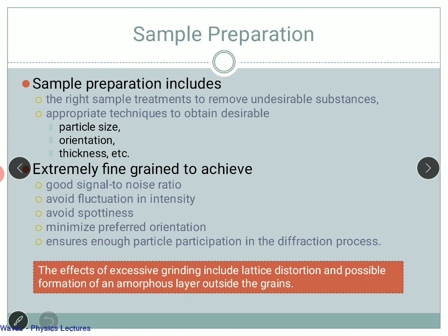XRD in the department, so we are going to use a powder XRD there. This slide is also very important, and you should remember each of these points. Please keep this note intact with you, because you are going to use it in your next semester, because this is going to be important.